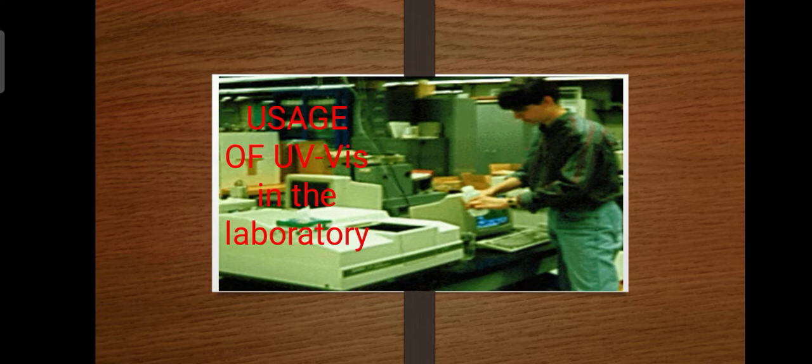The colors directly opposite each other are called complements. So for example, si red at saka si green are complements kasi 'di ba magkabaliktaran sila, magkaharap sila, opposite sila sa ating color wheel. So pag missing si red sa mixture ng ating visible light, ang makikita ng mata natin ay si green.